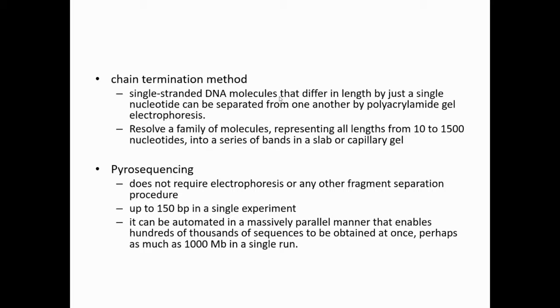After the chain termination sequencing, scientists later developed parallel sequencing, and the parallel sequencing also later developed into massively parallel sequencing, which is also one of the NGS technologies. So in the beginning, we will start from the chain termination sequencing.